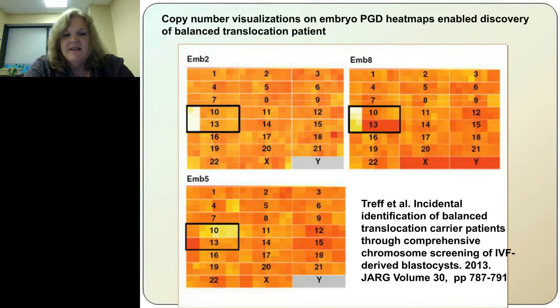And in this case, if you have a trisomy, it tends to be very bright white. And if it's a monosomy, it tends to go down to red. Think of hot iron, going from deep glowing red to very bright glowing white. So most of the orange colors mean copy number 2. It's in the median range.